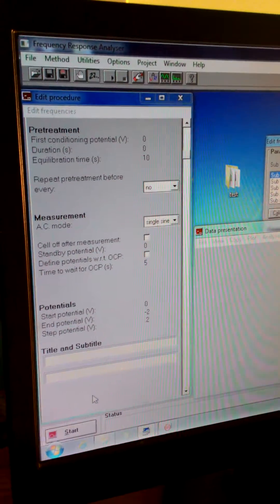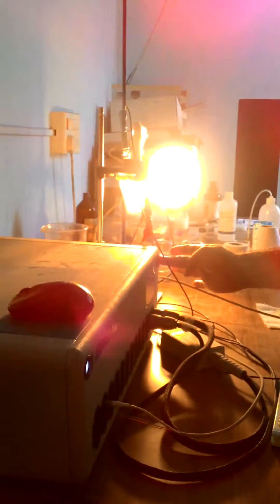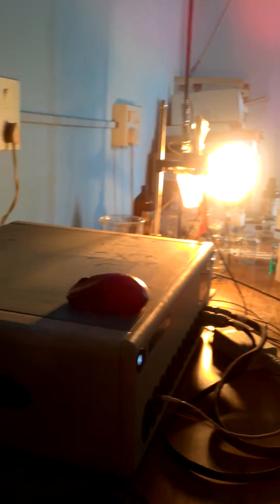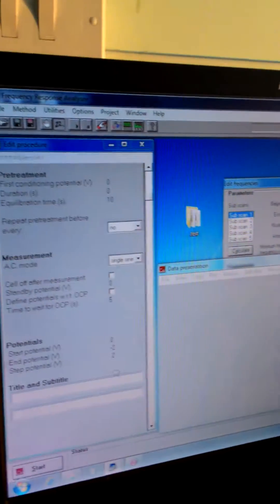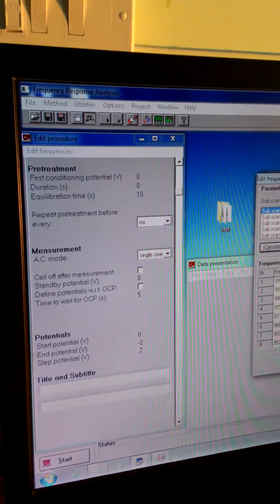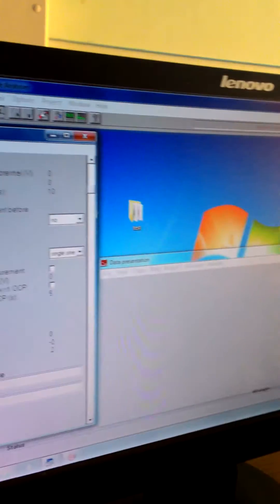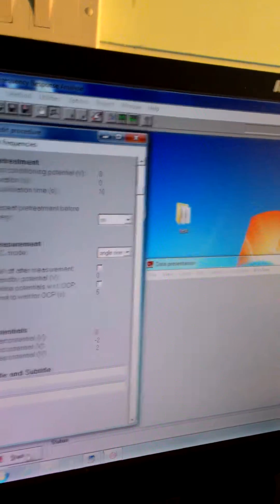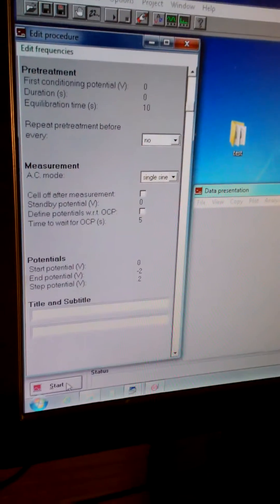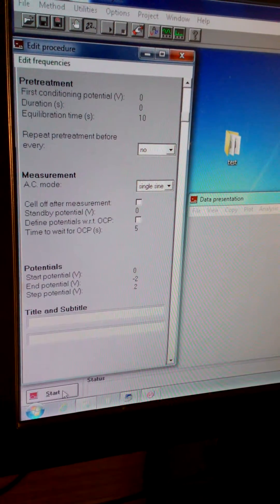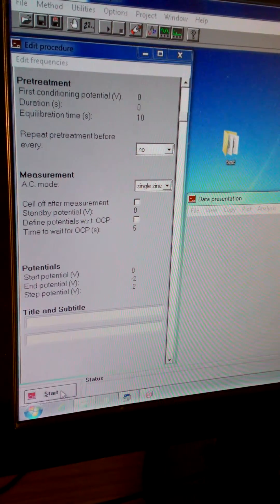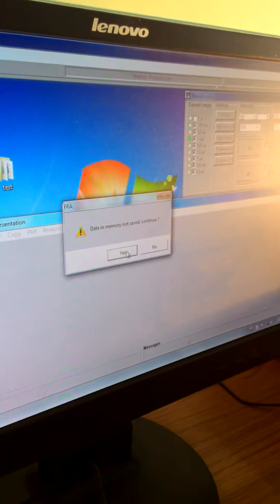Now you just switch on the cell. Then I start. Yes, continue.